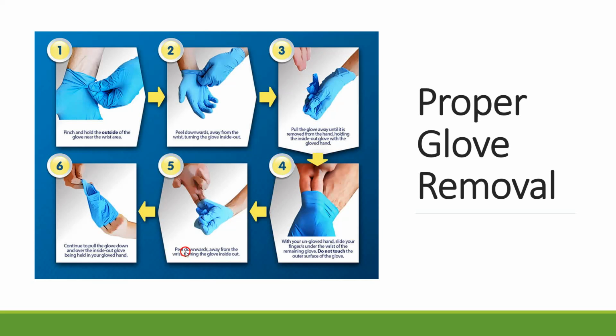So notice here, what we're trying to do is when we take a glove off, we're trying to turn it inside out without touching it on our bare skin or surface. So that's the goal here. Notice in the first picture, the gloved hand is pinching a piece of the glove and pulling it away, and then it's pulling it down, and the glove goes inside out. But it's always glove to glove, so no bare skin touching contaminated gloves.